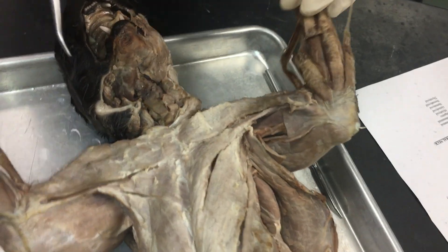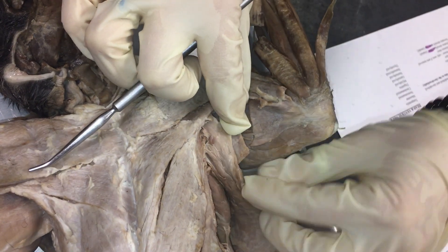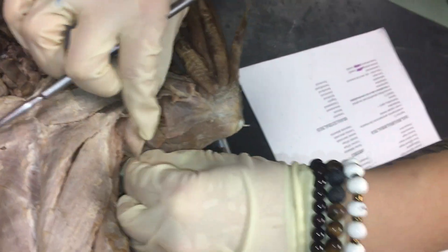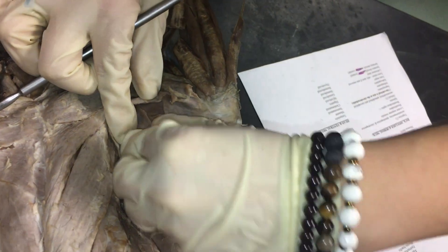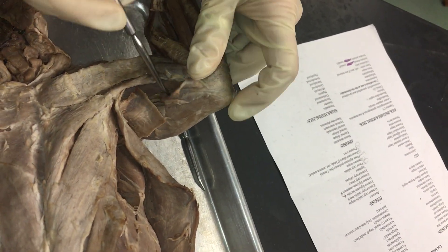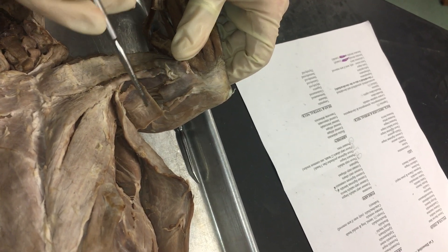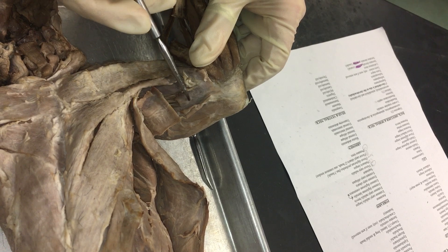Next we have epitrochlearis, which on your cat before it's dissected is going to be connected here and here. On this cat, it has been cut so that you can see the muscles underneath, but just be aware that this is one long muscle here.